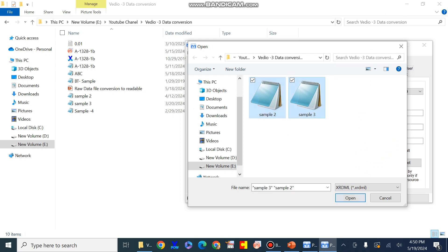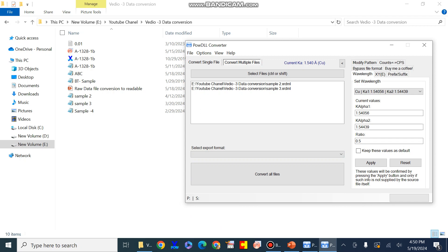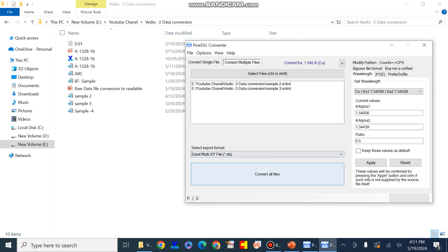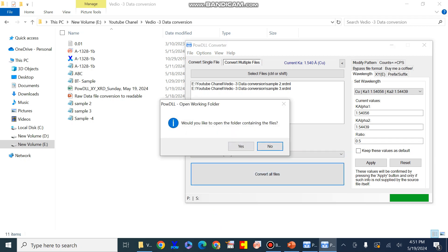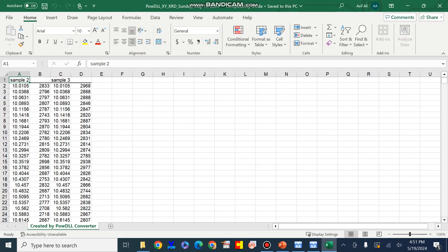These two files are in XRDML format. I will select both and then press Open. From here you can convert them into the file format of your requirement. I will again press Excel format to convert these files into Excel form, then press Convert All. We can see that the conversion is successful and we can open the converted files in the folder containing them. The conversion is successful and we now have our raw data files in Excel form.